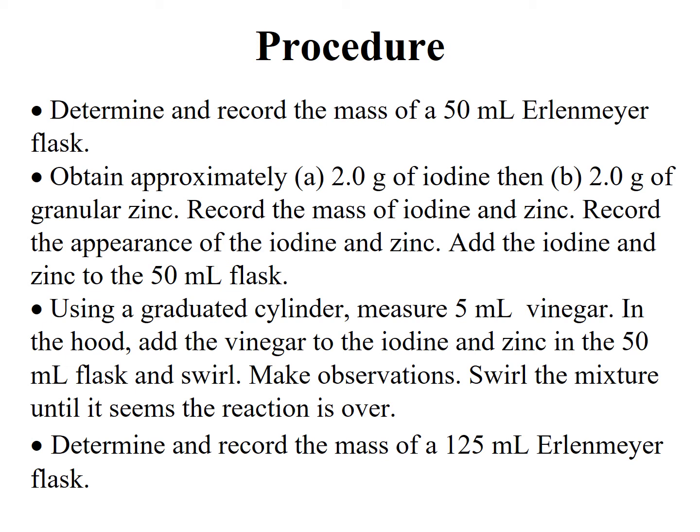Swirl the mixture until it seems the reaction is over. So you have to look at the videos. When are you going to know that the reaction is over? Then determine and record the mass of a 125 ml Erlenmeyer flask. So this is another Erlenmeyer flask.